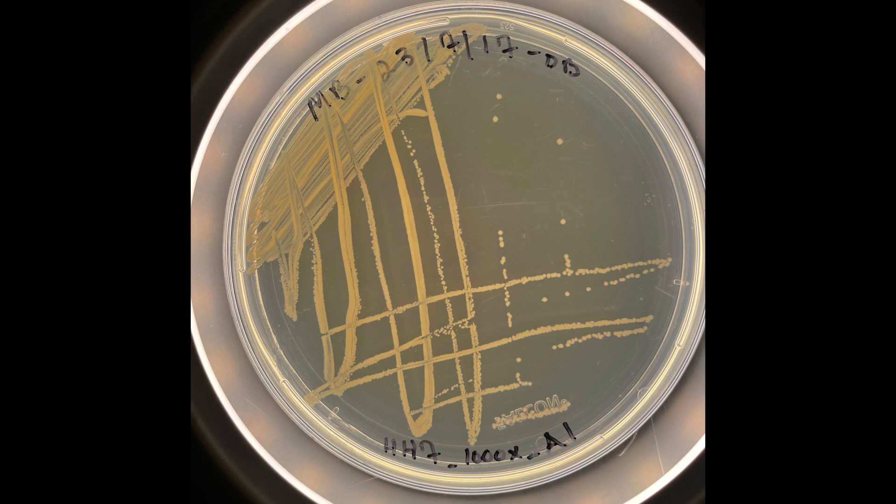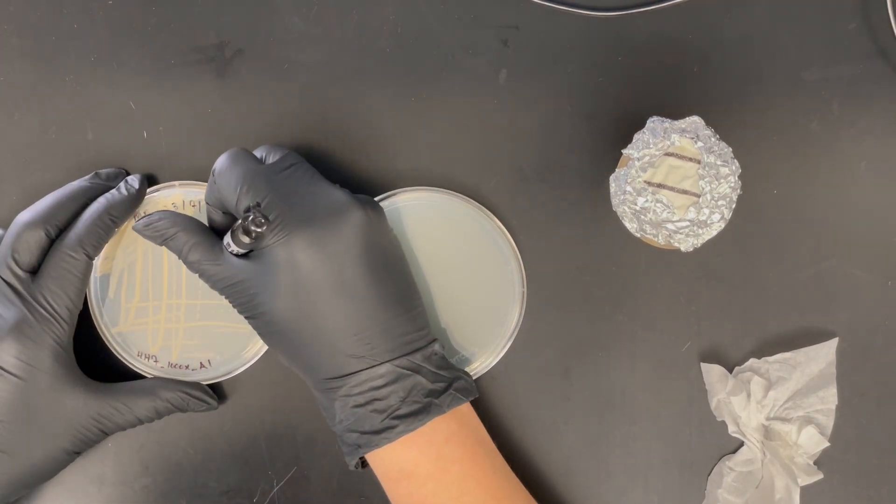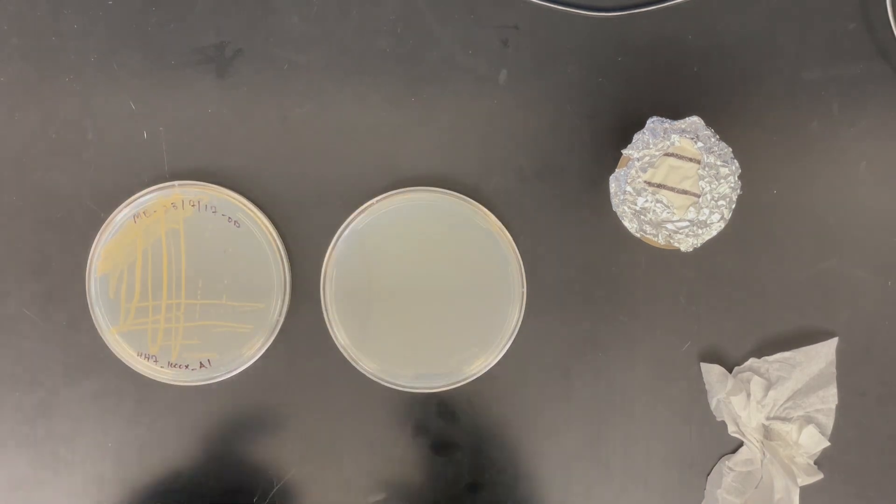What we're going to pick from here are some of those isolated colonies on the upper right-hand side. We're going to take those and transfer them over onto a new plate. We're going to label the plate. This new plate is going to have the same information as you see on this plate, except the date is going to be updated.